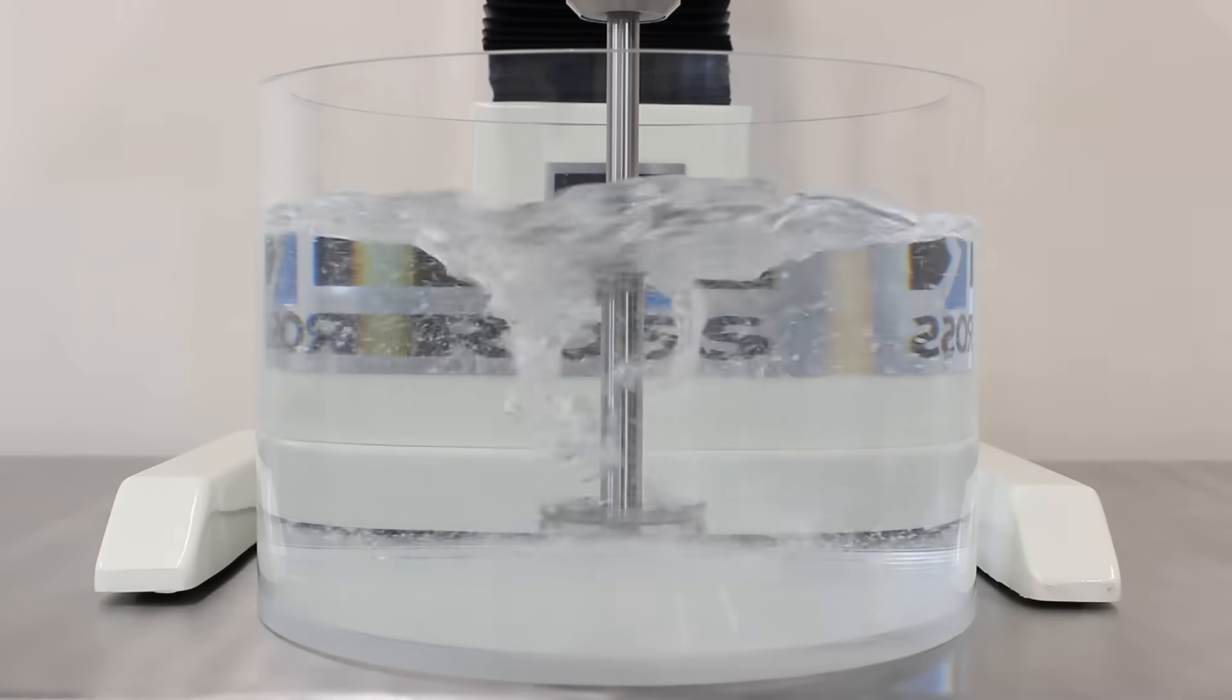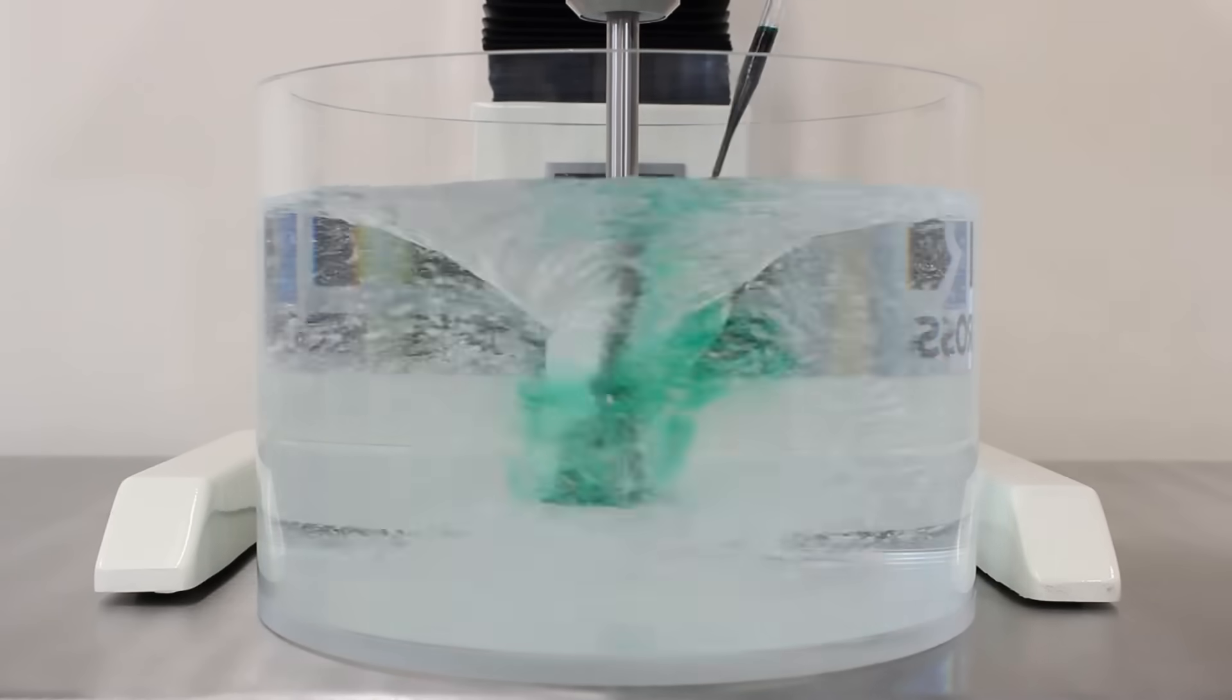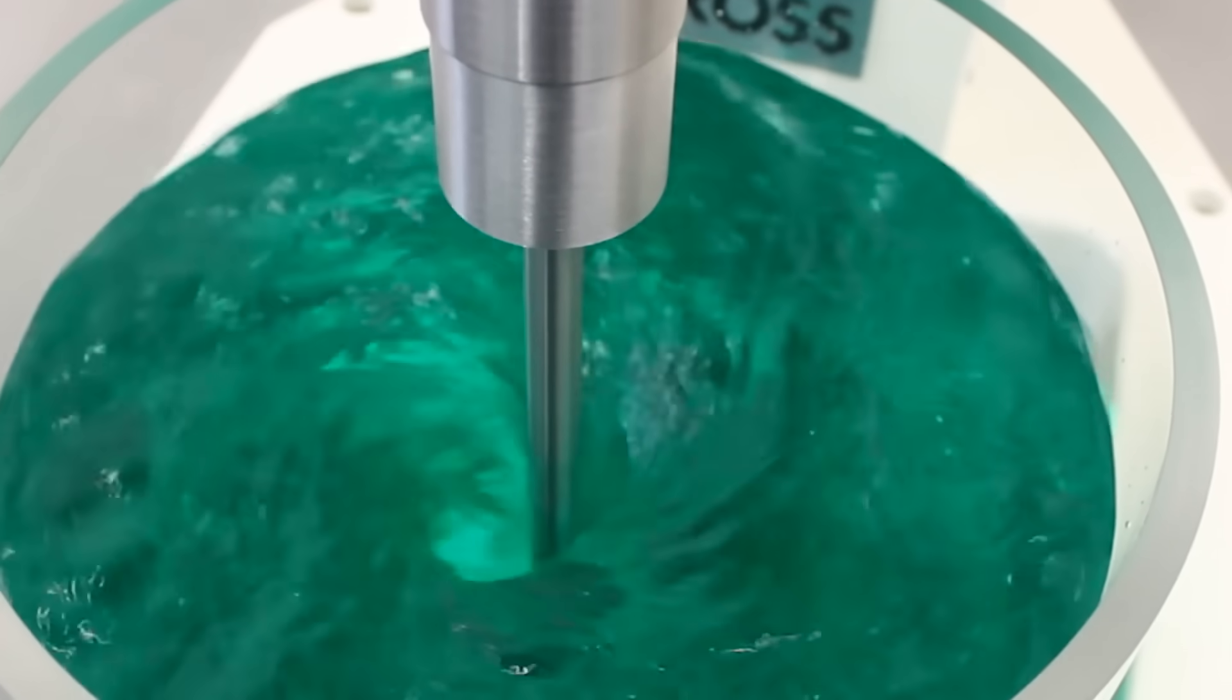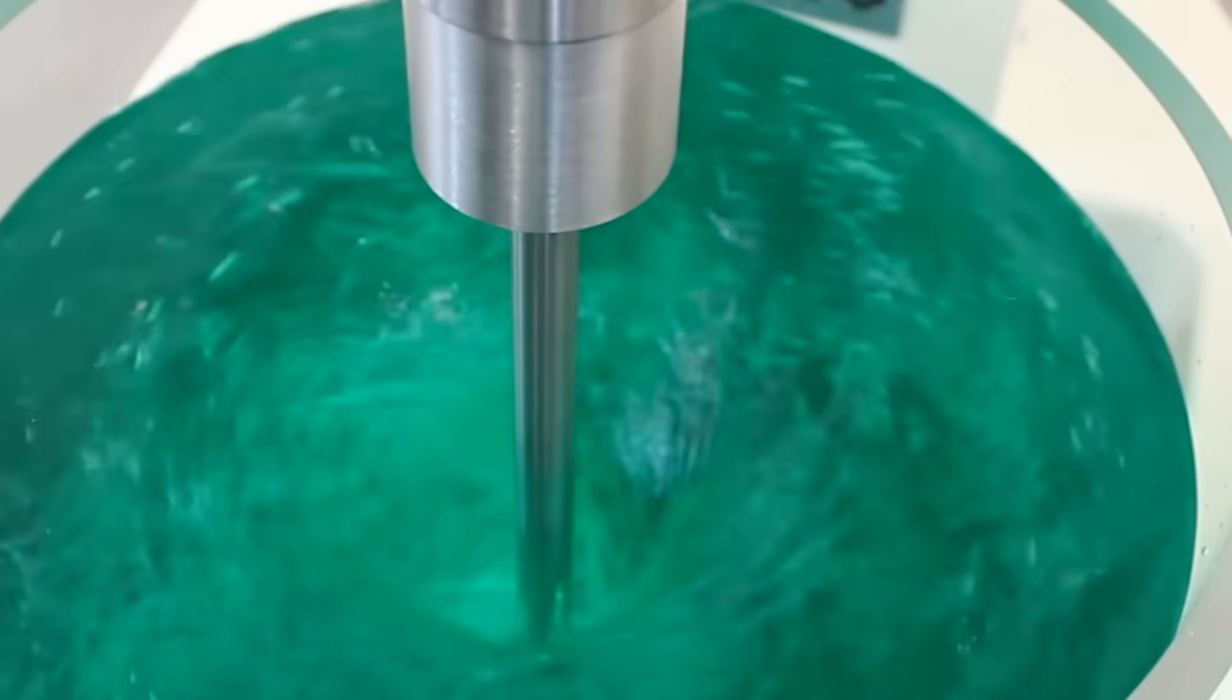The high-speed disperser attachment creates dispersions and emulsions by drawing liquids and solids into the vortex of the high-speed blade, where these ingredients are exposed to intense sheer force, creating a uniform product.